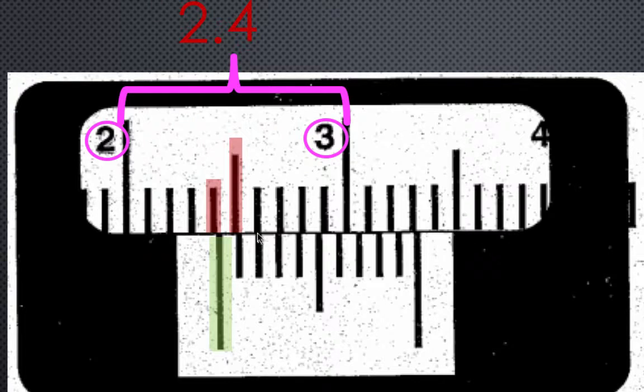But this next one is lined up pretty well, because if you keep going here, this one is a little offset, and then the rest of them you can tell are very offset compared to the lines above them. So this is the marking that lines up the best with the line above it on the fixed ruler. This happens to be related to a 2. The reference line is a 0, this is a 1, this is a 2, this is a 3, and so on all the way down the line.